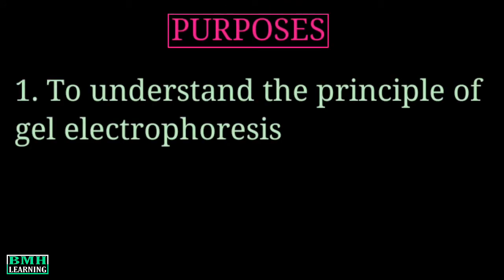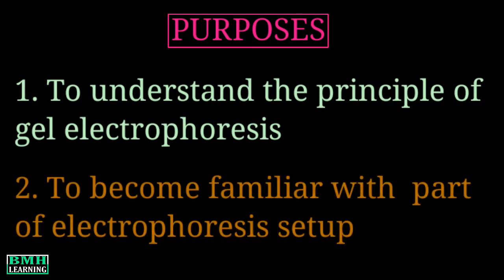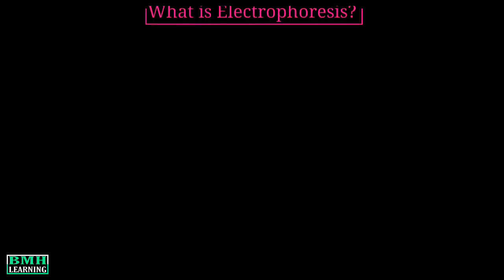This lecture is regarding gel electrophoresis. Before you get into this topic, you must have two purposes. Purpose number one, to understand the principle of gel electrophoresis. Purpose number two, to become familiar with the parts of the electrophoresis setup. Let's begin our discussion with the term electrophoresis.